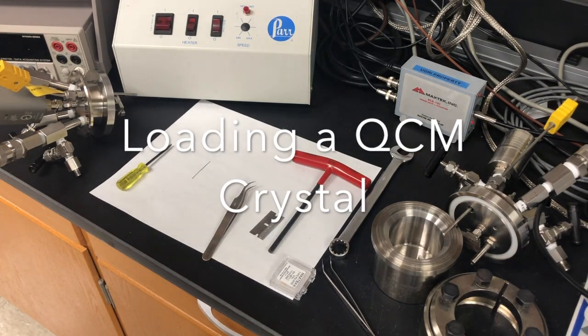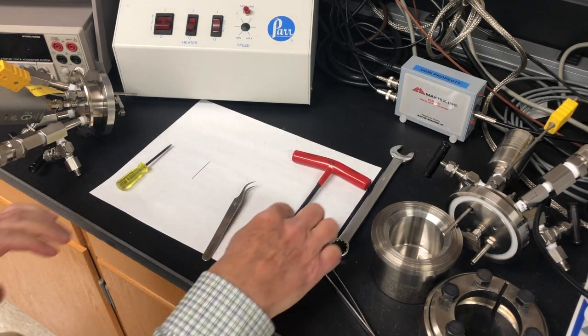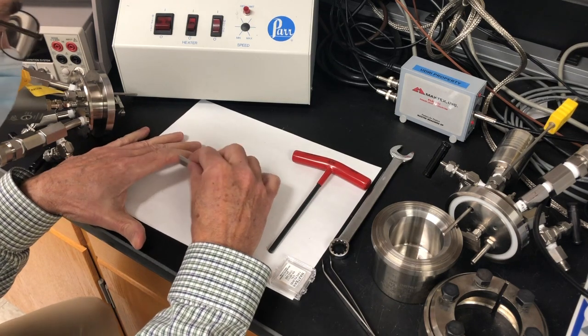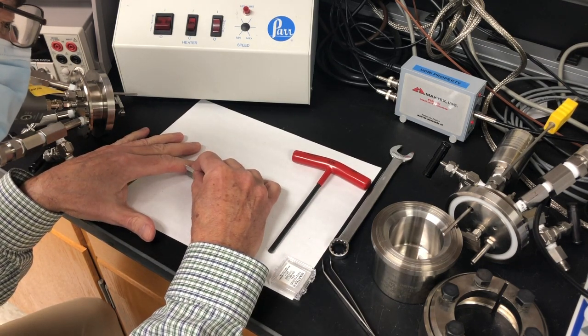Loading a QCM crystal is the most difficult part of this system. At first we take indium wire and cut two half millimeter pieces.